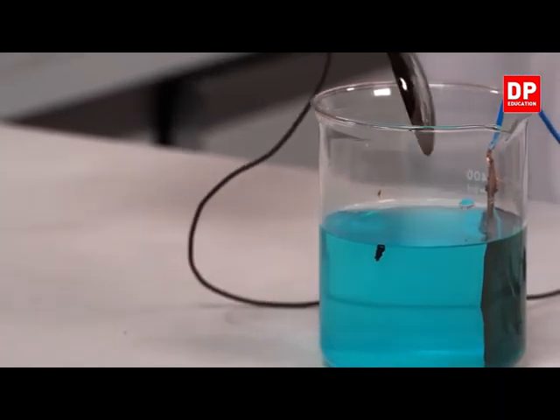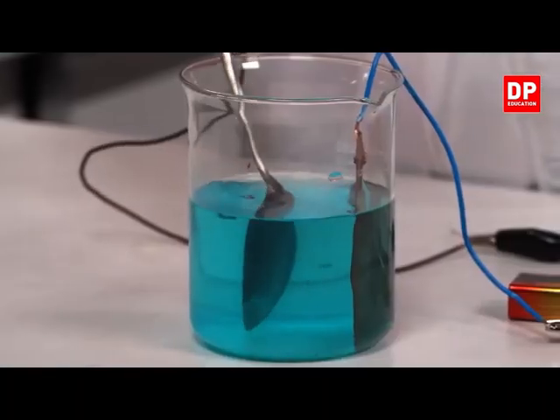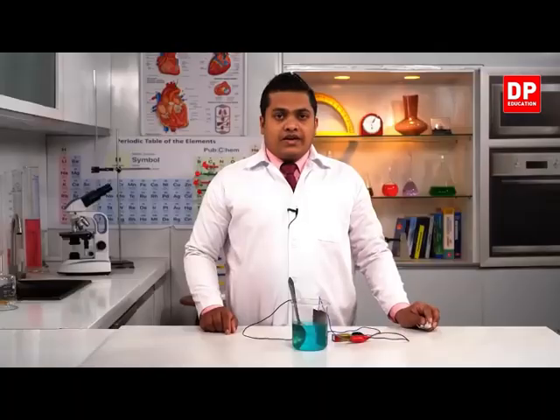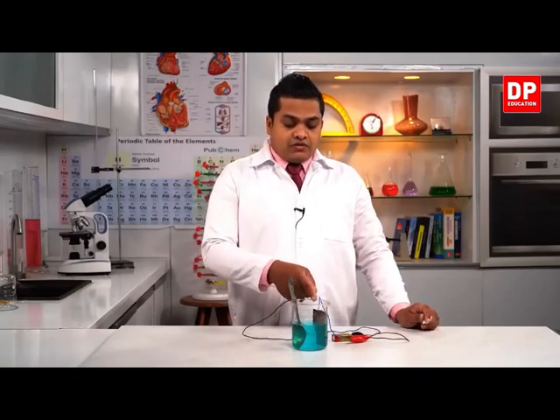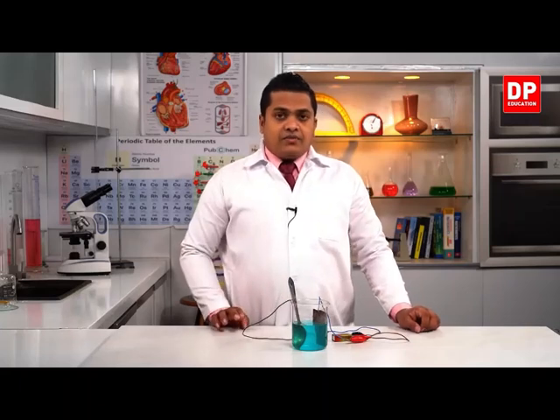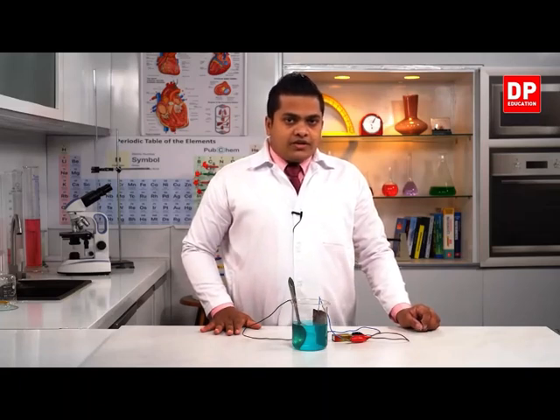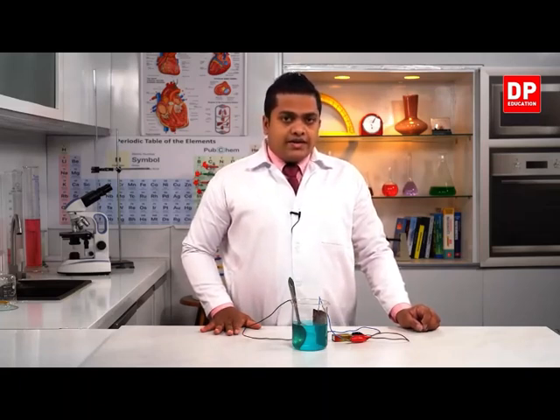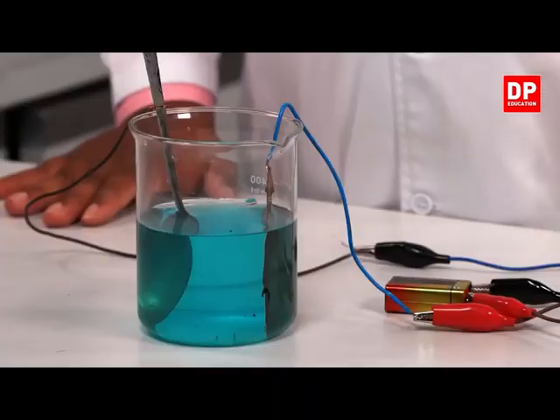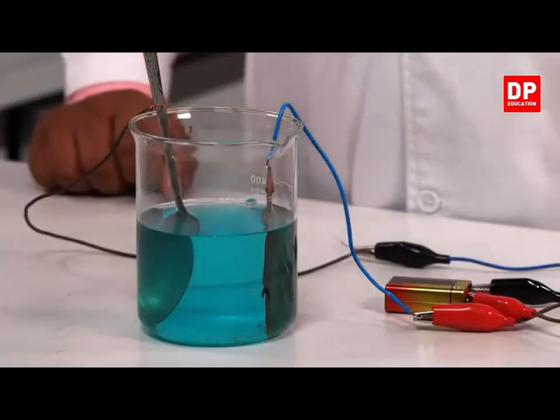Right. So here we can finally conclude that within this system, when I provide electricity to the copper sulfate solution, with the copper plate at the positive terminal, then on the negative terminal we can plate copper, right? So always the object on which the metal needs to be plated should be at the negative terminal, while at the positive terminal you have to use a metal rod or a piece of the metal that we are going to plate.